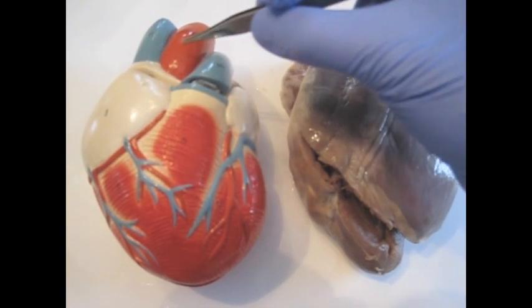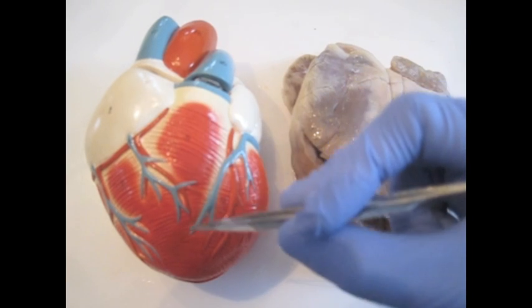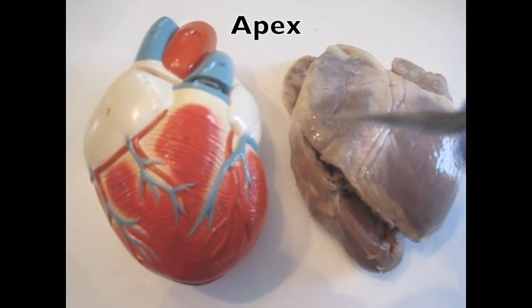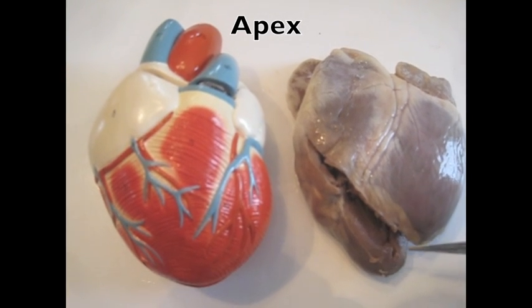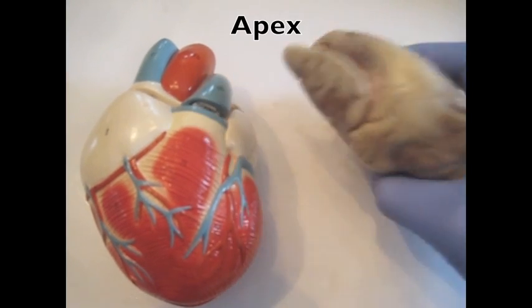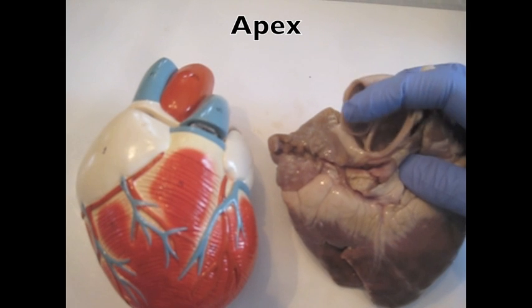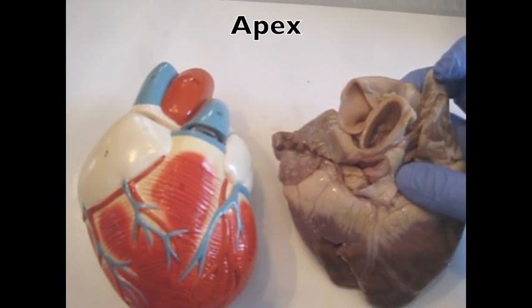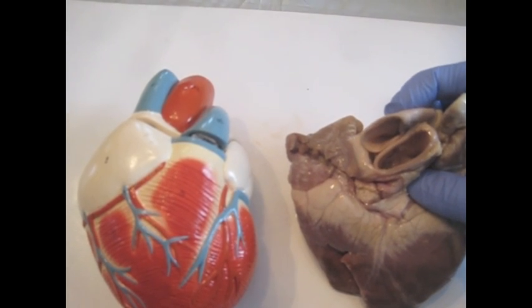The aorta and the pulmonary trunk, shown here, extend off of the base, or the superior side of the heart. The apex, or the point, extends down from the inferior portion of the heart. So determining the top and the bottom is relatively straightforward. On the sheep's heart, you can see the pulmonary trunk and the aorta. The aorta has a thicker wall than the pulmonary trunk.